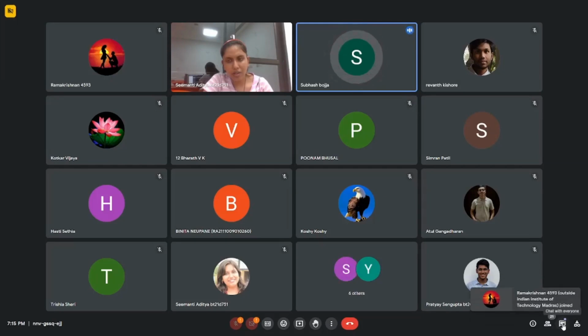It's just an indication, to represent to ourselves that the temperature has been reached. But we have to make sure by seeing the reports or the temperature sensor and everything that the autoclaving is perfectly done. These only give an indication, not exactly 100% assurance. This is our personal indication. So the answer will be that it doesn't give the assurance, but it is for indication.